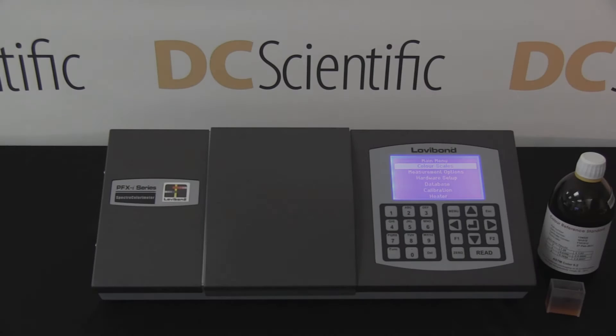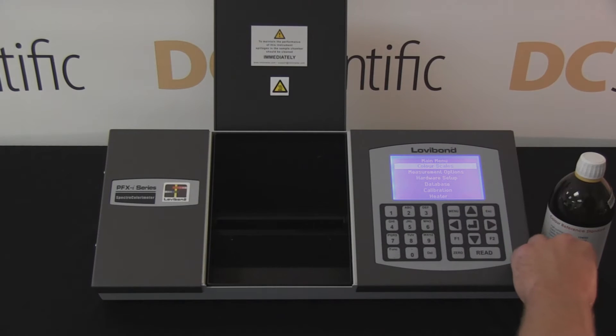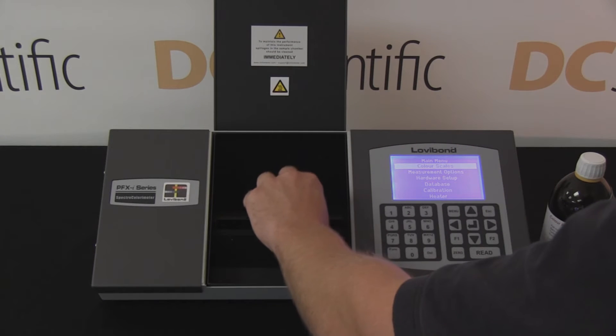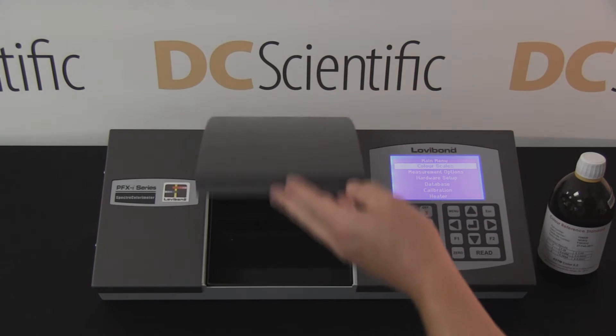DC Scientific presents the Lovabon Tentometer PFXI995P for determining ASTM D1500 color. To demonstrate the accuracy of the spectro colorimeter, the technician performs the test using an ISO 17025 certified standard with an ASTM value of 5.2.